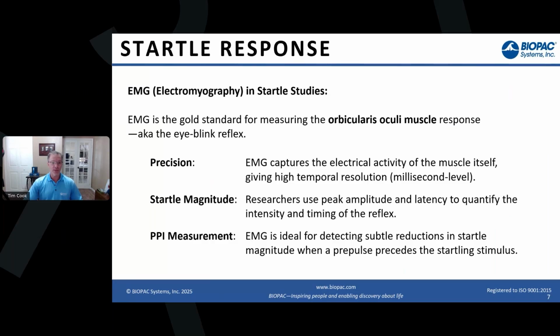And we generally use EMG primarily because we're looking to capture the actual electrical activity of the muscle, and ultimately wanting to look at the peak magnitude of that and the latency from when the startle impulse happens to when the blink reflex occurs.